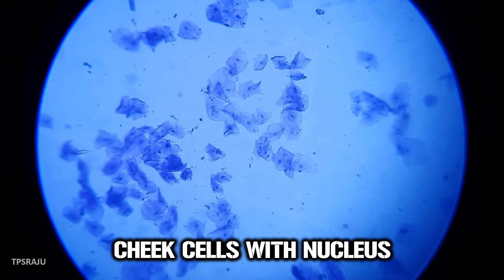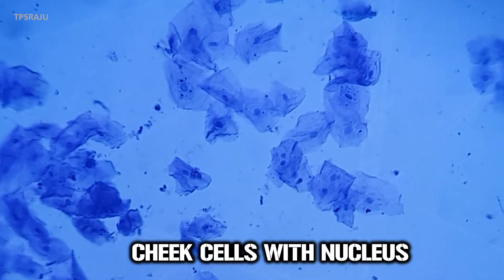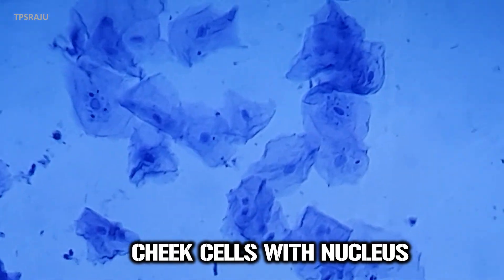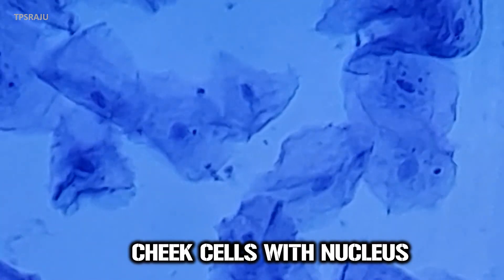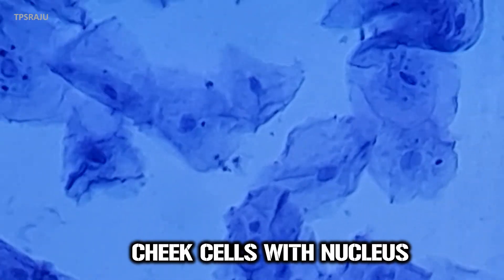Once again, observe carefully. There is a dark colored spherical dot-like structure in the center of each cell — that is the nucleus.